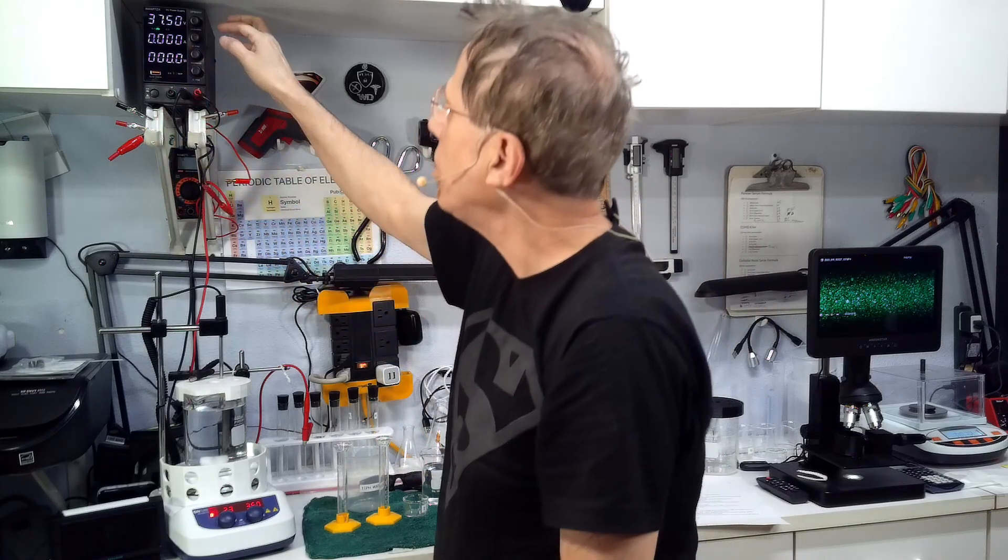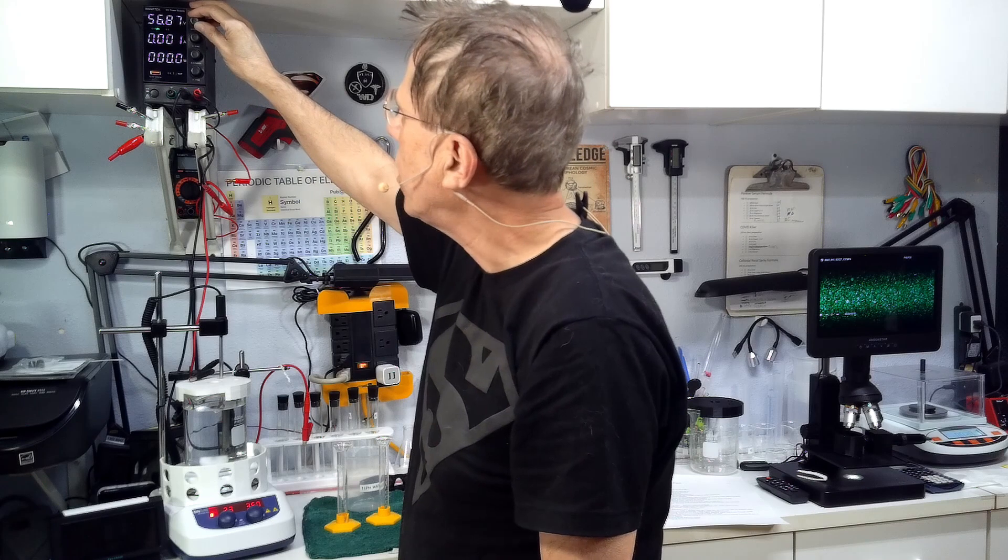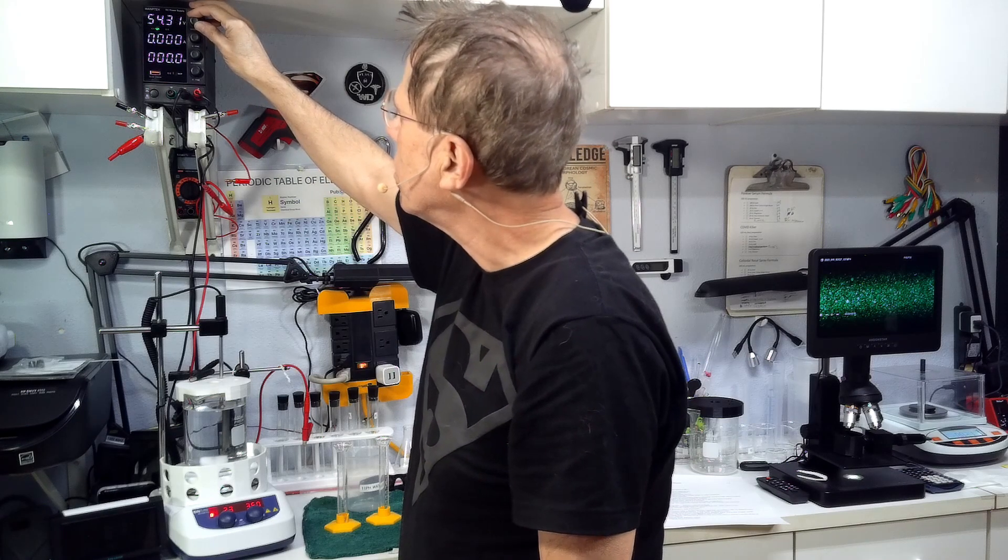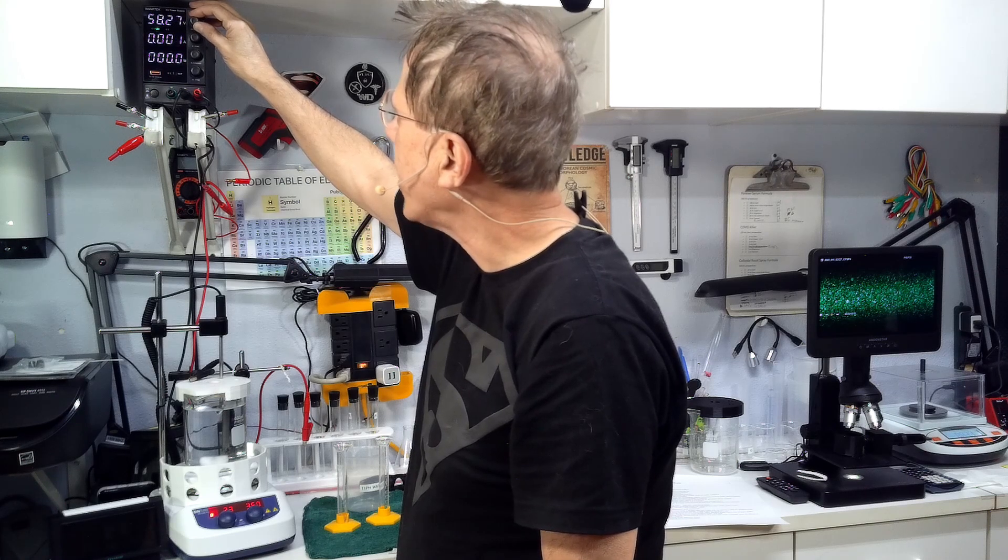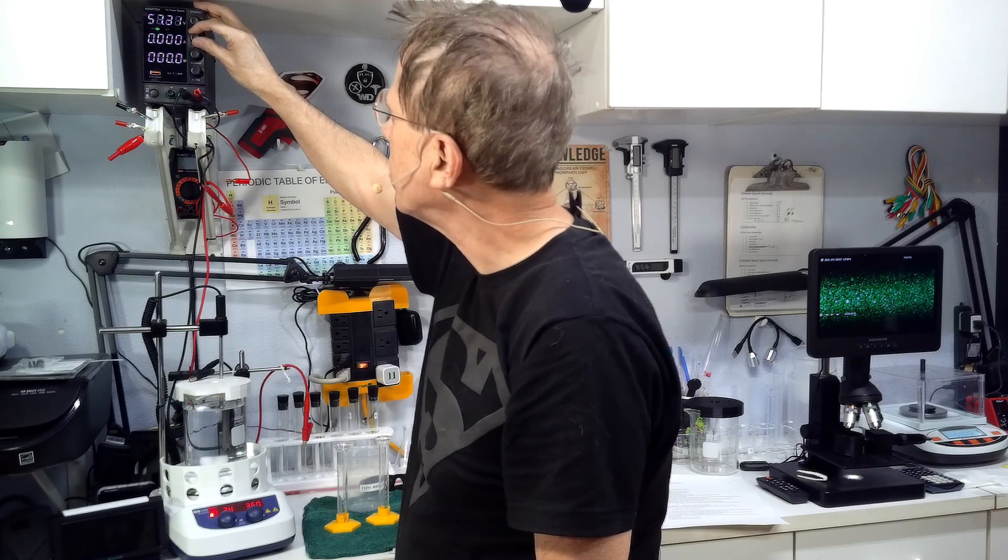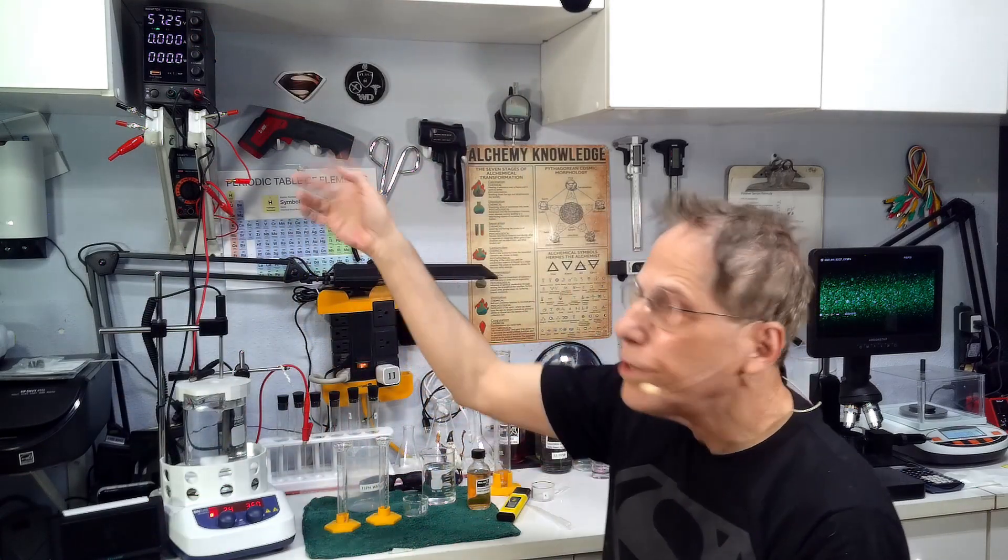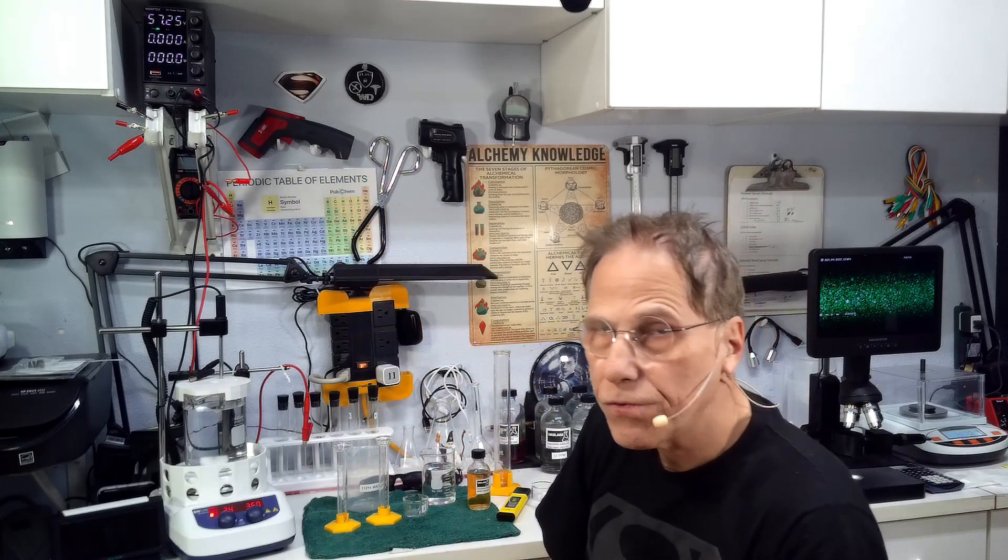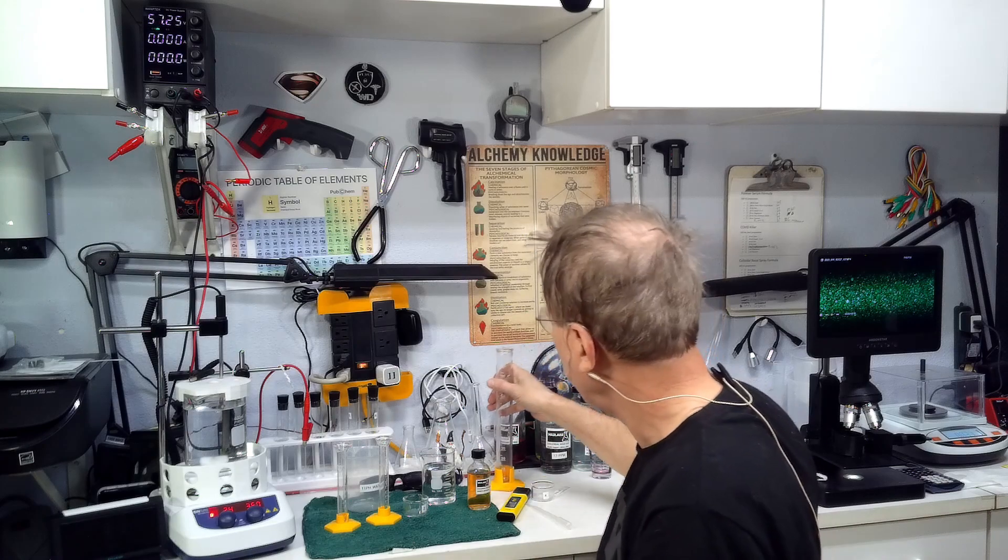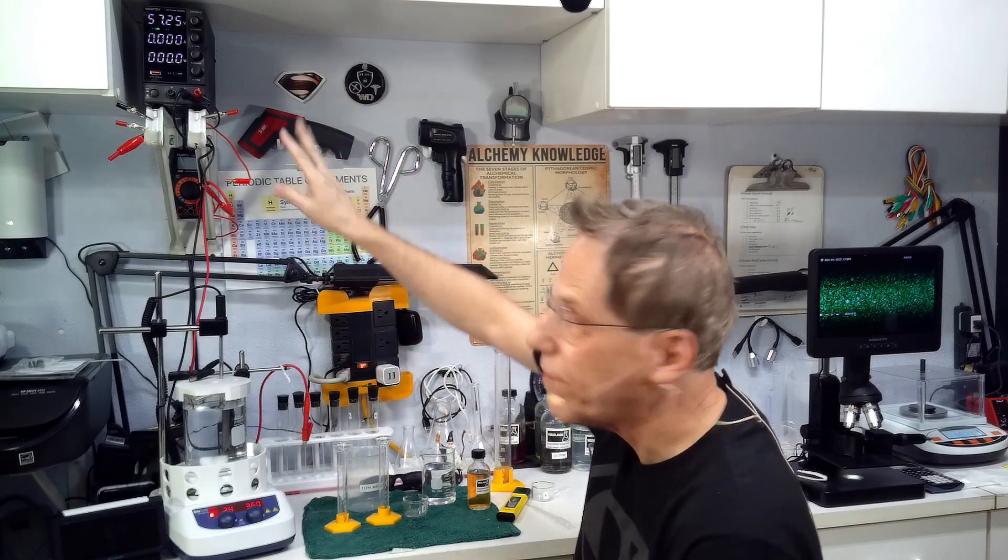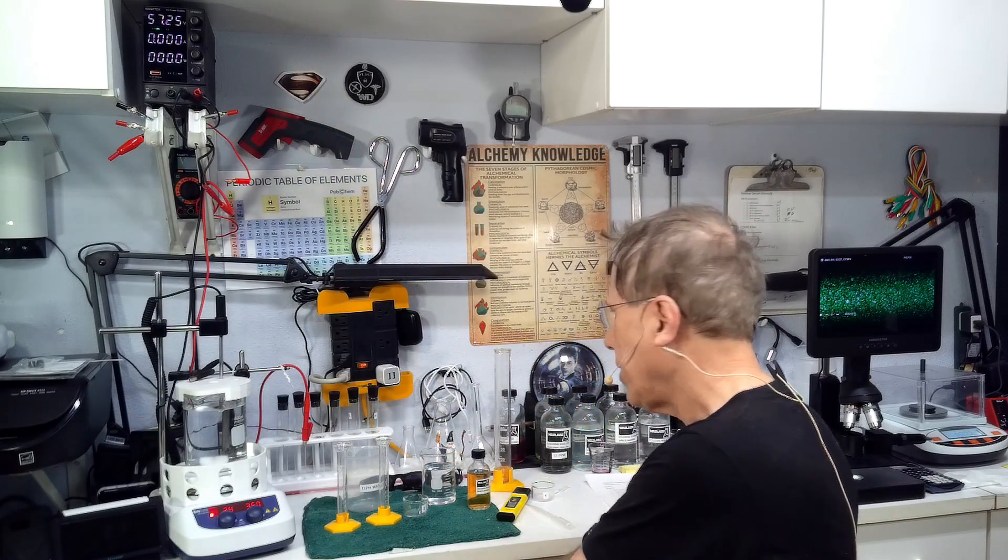For starting up you're going to turn the power supply voltage up to 57 volts. This is a 0 to 60 volt power supply at a maximum of 5 amps. I'm just showing you the voltage to set your thing at.